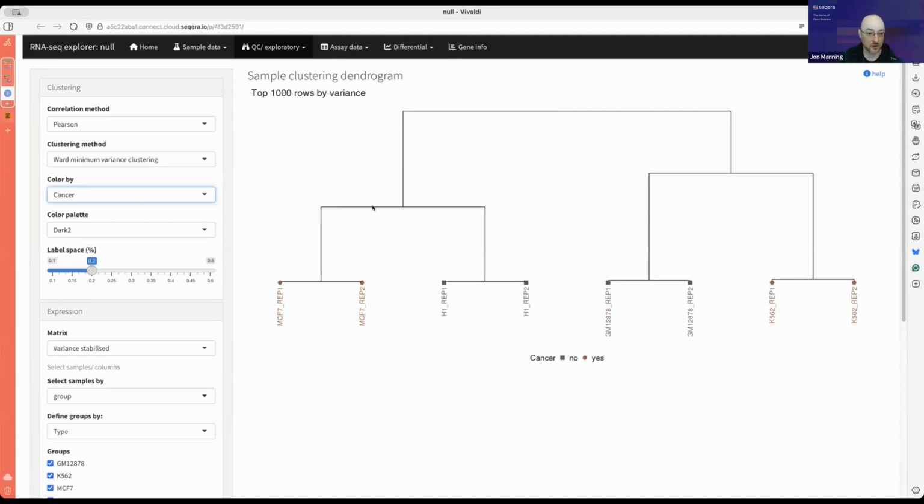So maybe another contrast we could do is looking at cancer versus non-cancer, but accounting for the effect of blood status in that. Okay. Yeah, that sounds like a good idea. Okay, so if you want to share back to me, I'll run the workflow for you. Okay, so yeah, you can go back and rerun that analysis for us in this scenario.